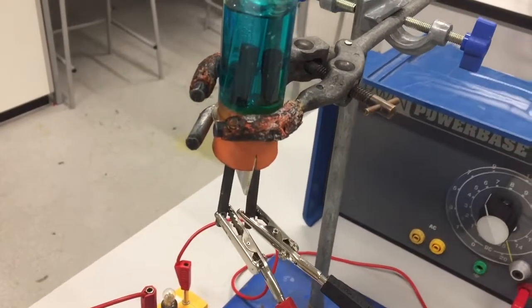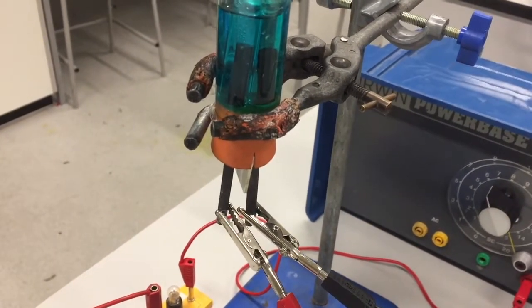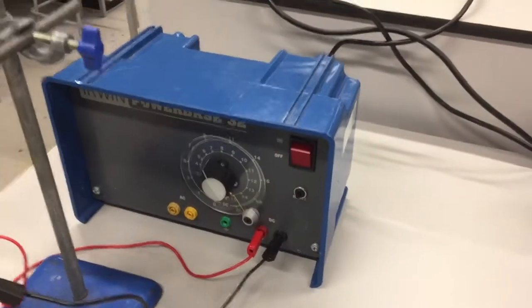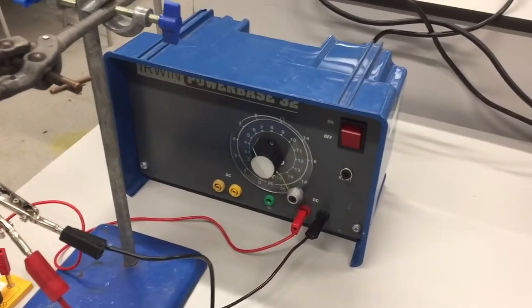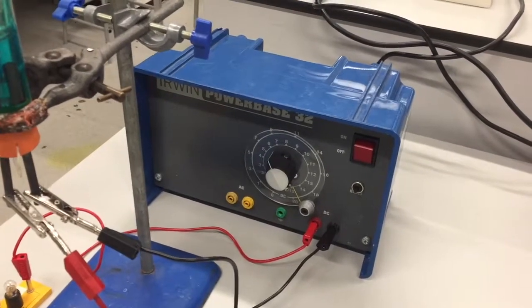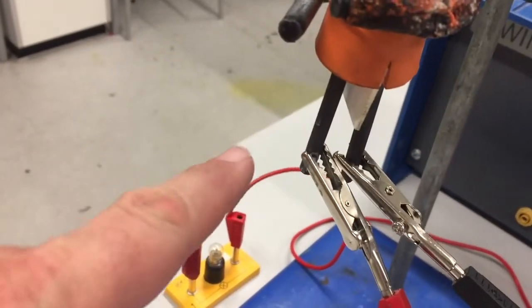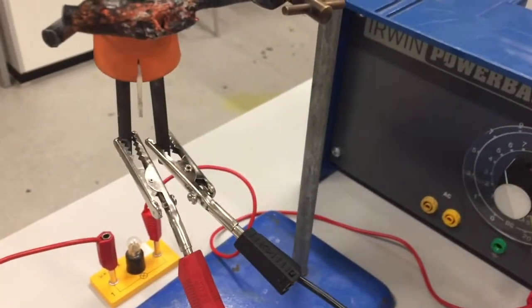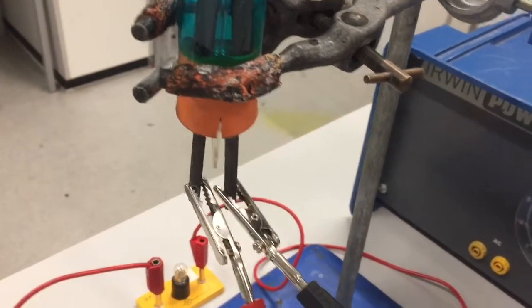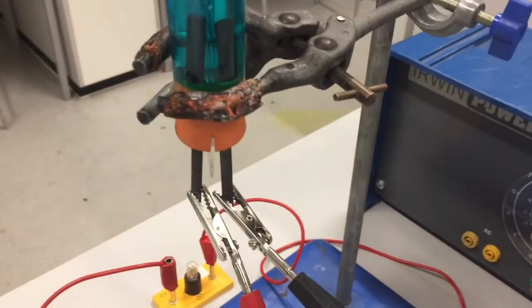And we've got our 2 graphite electrodes, which are the inert electrodes because they're not going to react with the solutions. And we can start just simply by tracing through to say which one is the anode and cathode. So we've got our acronym PANIC, positive anode, so red is positive. So this one's going to be the anode, and the PA is positive anode, and then negative cathode from PANIC. Okay, the black wire is the negative, so this is the cathode.